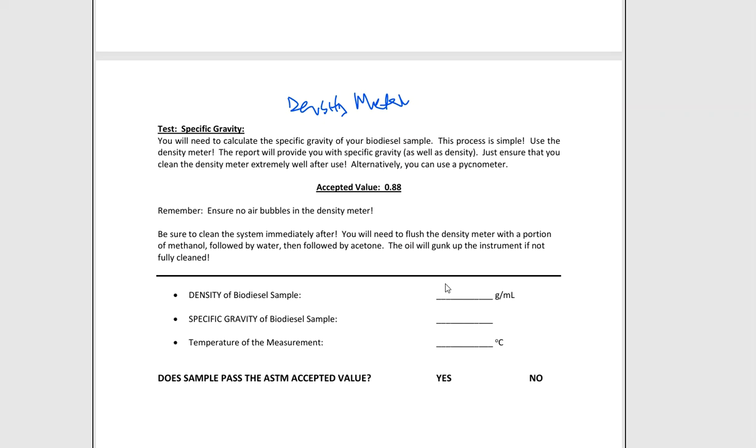Nothing really that I have to talk about here as well. The density meter you've used already, probably this semester. You also used it in probably 114 and 115 both. You know how this thing works, and its job is to give you the density of the solution that you are using. There's no calibration that's going to be needed either for the instrument. We're going to assume that it's working the right way. So literally inject the sample into the instrument.